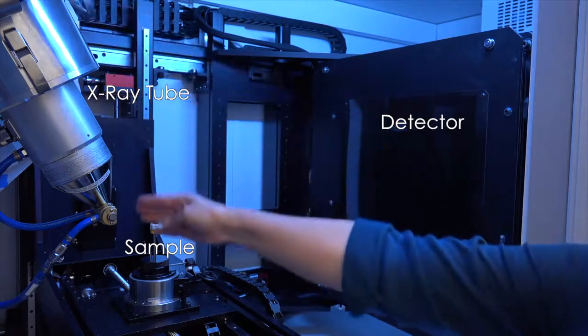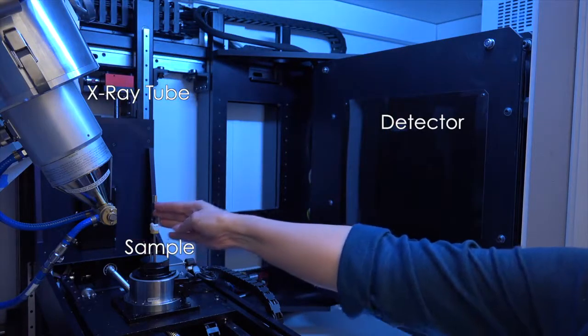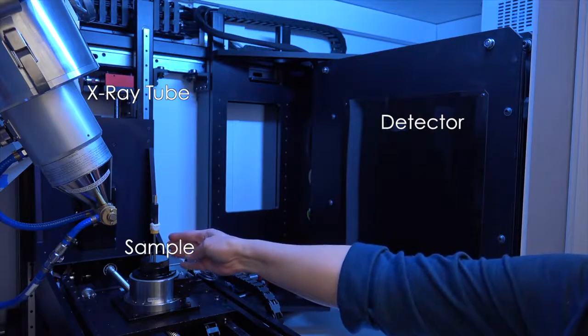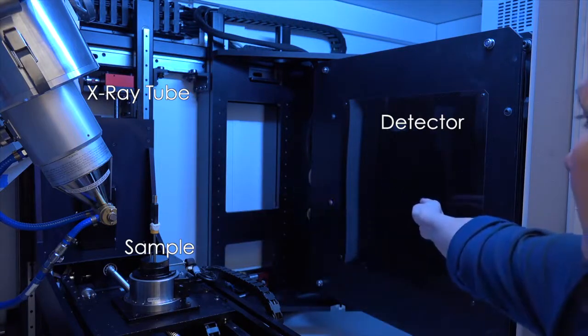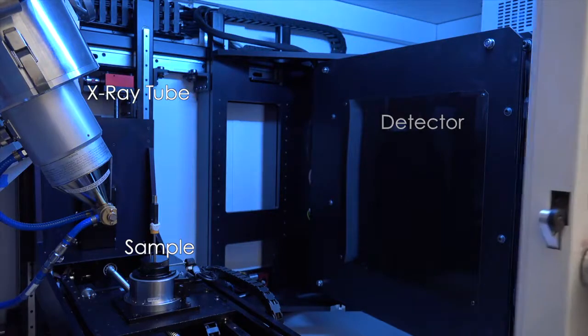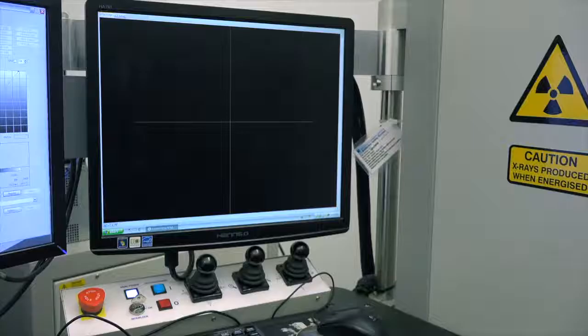When the x-rays reach the sample, some are absorbed by the sample and some are transmitted through to a detector. The detector is like a digital version of film and sends the image information directly to the computer monitor.